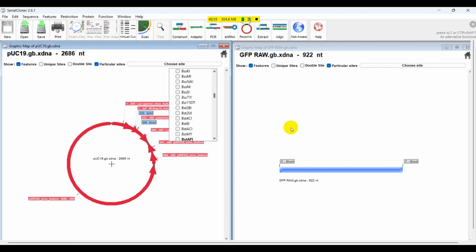From those copies you can use those two restriction enzymes that you used before for cutting the MCS and for joining GFP. So if you give the restriction enzyme in that place, the ligated sequences will be cleaved out and you can extract the desired GFP.